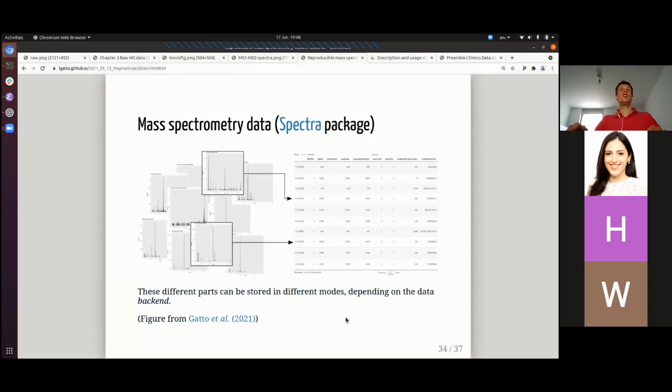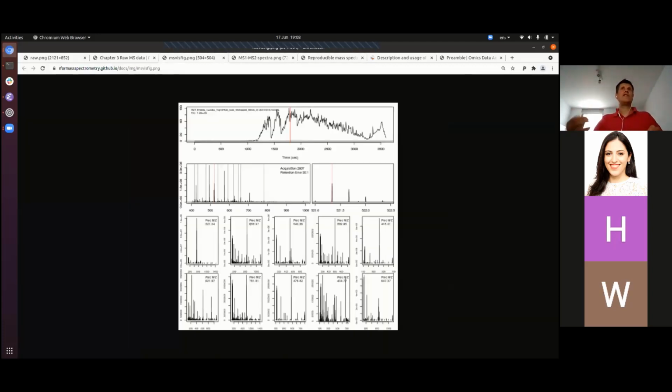And on the other hand side, you know how to make use of the data structure to access the different parts of interest. And I think that gives you a nice set of tools to be able to explore and really understand mass spectrometry data beyond feeding them into a black box, which is also something that you might want to do if you want to use specific software that will analyze and quantify your data. But in some circumstances, you might want to have more fine-grained control and understanding of your data.